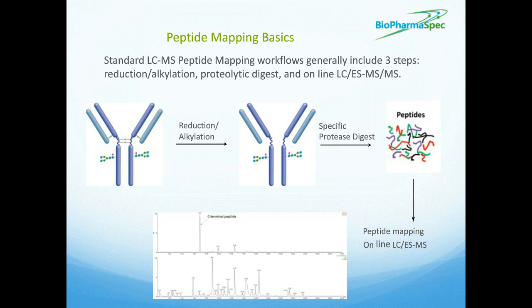So in this figure, our general workflow is we receive the protein, we do a reduction and alkylation experiment, we do a digest with a known protease, and then we put it on the instrument for LC-MS analysis.